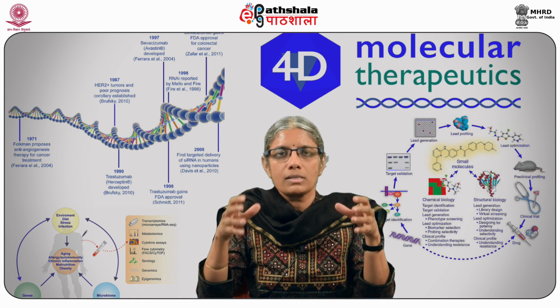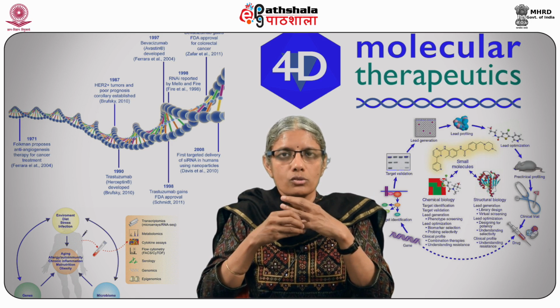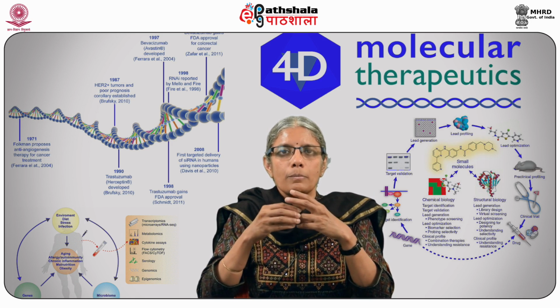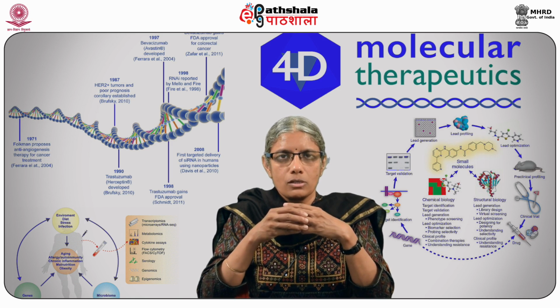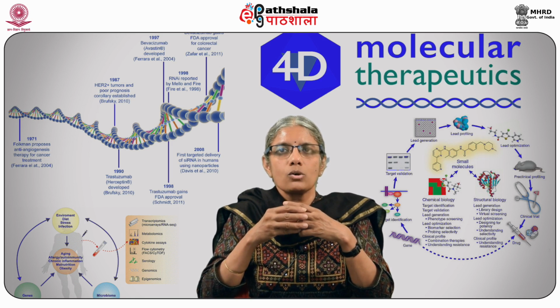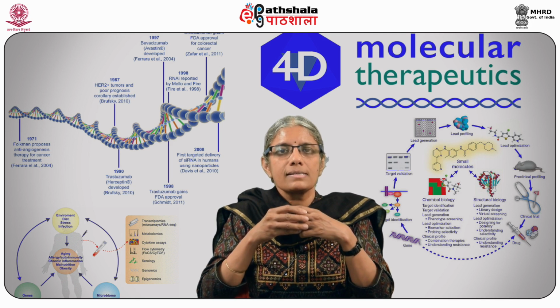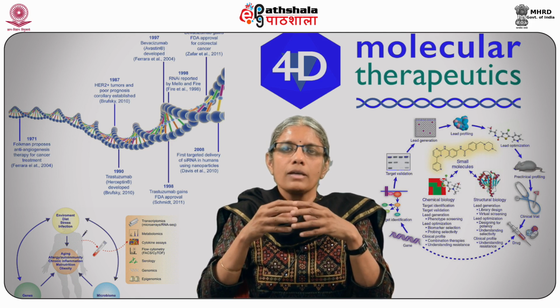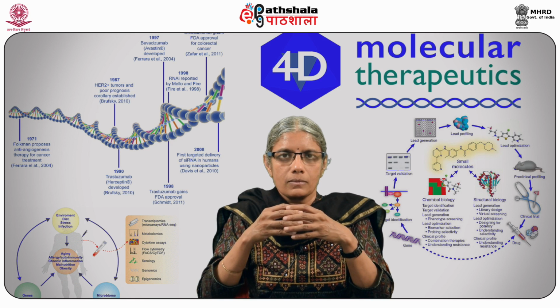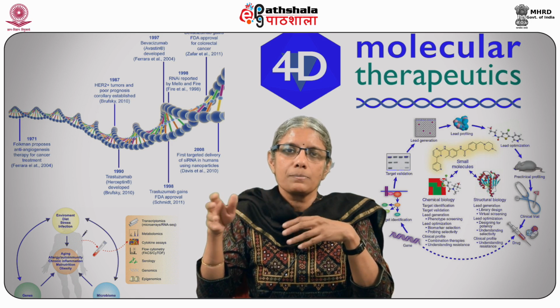Briefly, the growth of the cell or the passaging of the cell is done by thawing the frozen stock, putting the cells into a culture medium, and when they reach 50 to 70% confluency, the cells are trypsinized. The trypsinized cells or the detached cells are then collected into tubes. The pellet is then transferred into another flask following the cell count by using a hemocytometer. At this stage, the cells can also be frozen down for subsequent work.